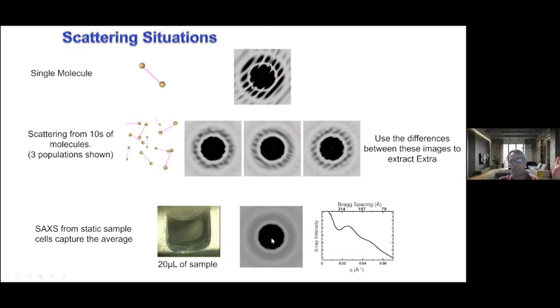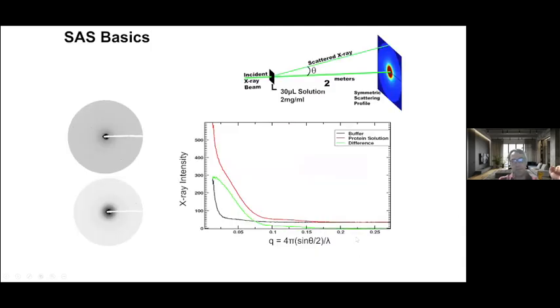And it's so much less fine structure that, in fact, you integrate rather than take these images. Like you might want to take these images in this case, but here we're just taking full 2D images to improve our signal to noise. If you take this line and integrate around it, you get the same as if over here. And we just kind of average through when we plot X-ray intensity versus Q. So that's what we're in the business of.